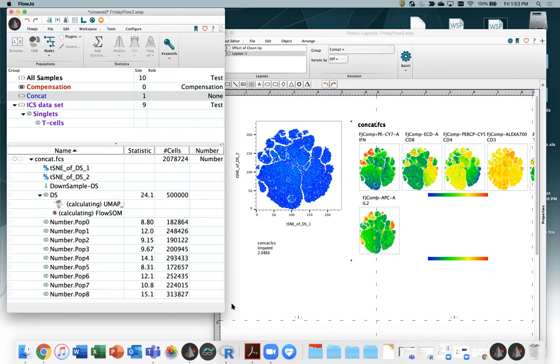Number of processors is kind of the major price point when you're buying a computer. 4 to 8 to 16 processors, or cores as they're frequently called, are all big jump points in price. So you're going to tend to get what you can afford or what your budget has been given. This is a 2 processor machine that I'm working on right now. People have better, but it's a Mac, so it's got that going for it as well.